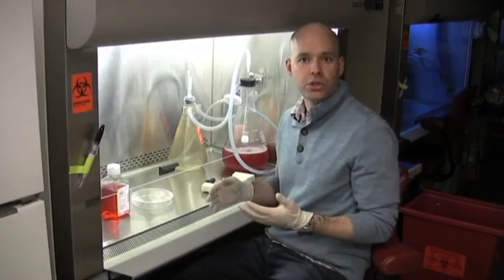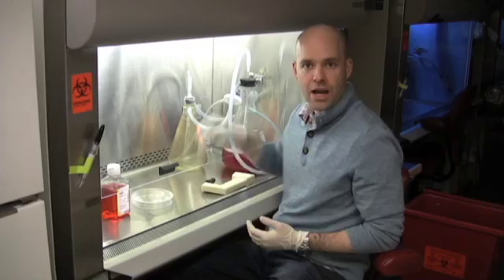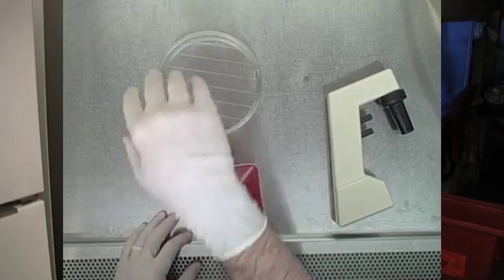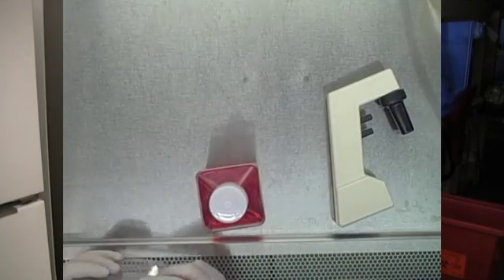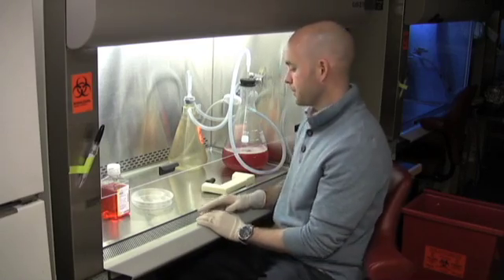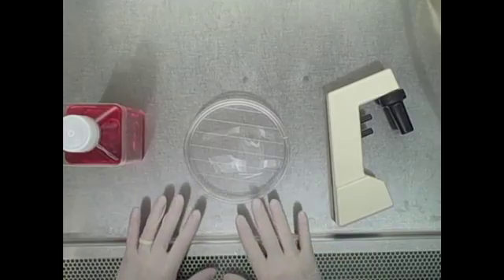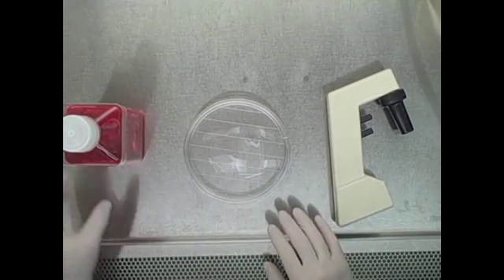Now when you're working in a tissue culture hood the flow goes from the top to the bottom so there's a strong downdraft inside the hood. Therefore you don't want to have your hand go over an open bottle or an open dish because that's a likely source of contamination. So the easiest way to set up a hood is to keep things separate so that you never have to reach over something else.